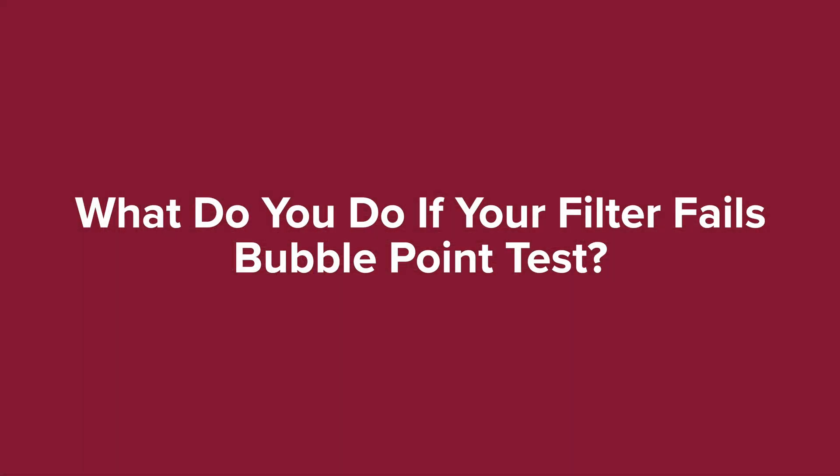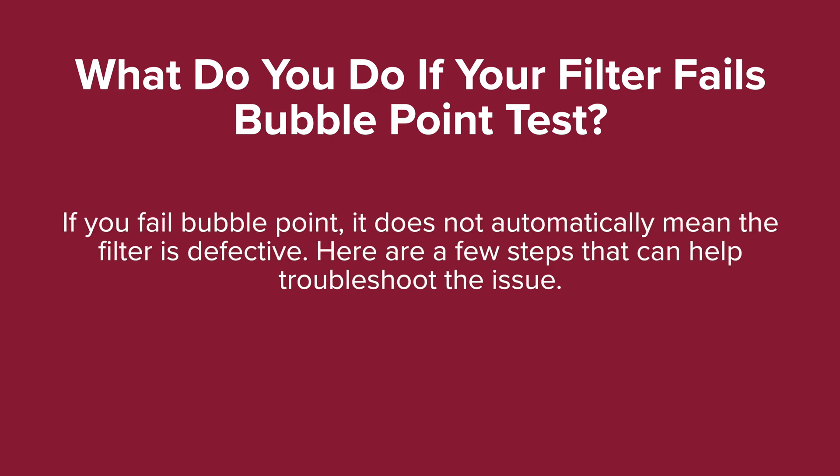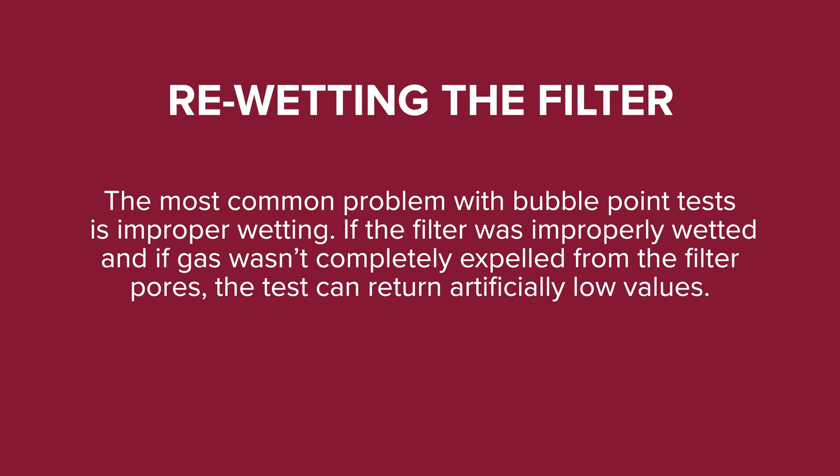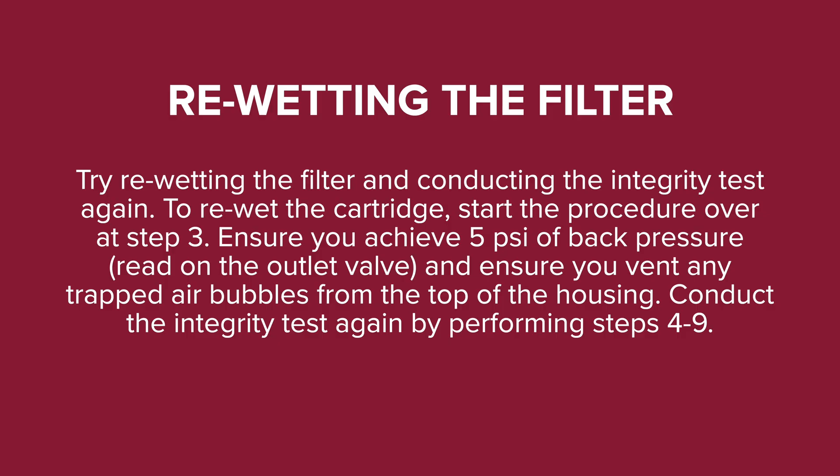What do you do if your filter fails the bubble point test? If you fail the bubble point test, it does not automatically mean the filter is defective. The most common problem is improper wetting — if gas wasn't completely expelled from the filter pores, the test can return artificially low values. Try re-wetting the filter: start the procedure over at step three, ensure you achieve 5 psi of back pressure on the outlet valve, and vent any trapped air bubbles from the top of the housing. Then conduct the integrity test again by performing steps 4–9.